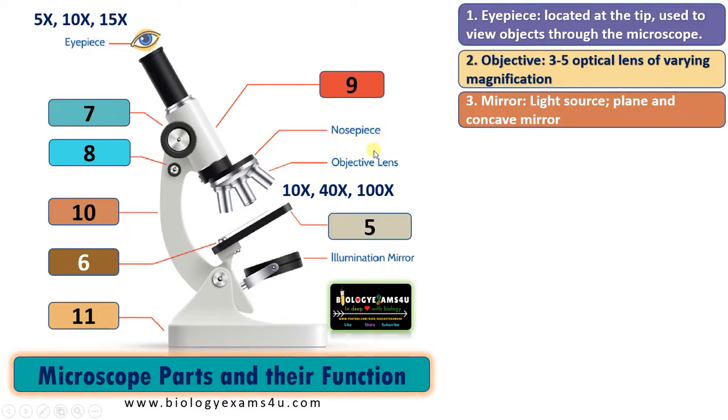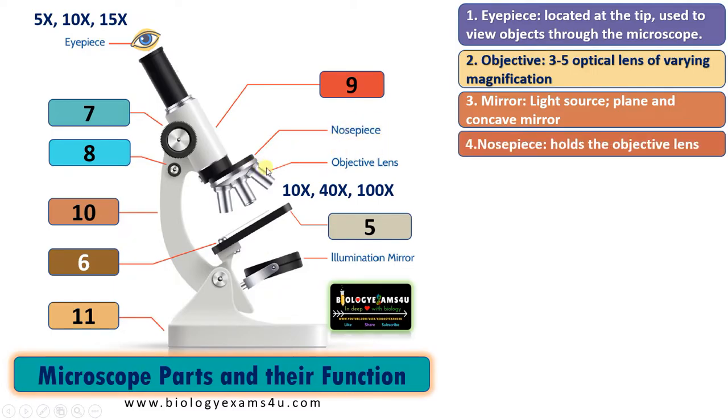The next part is the nosepiece. As you can see, the nosepiece holds the objective lenses and can be rotated. It holds the low power, middle power, and high power objectives.